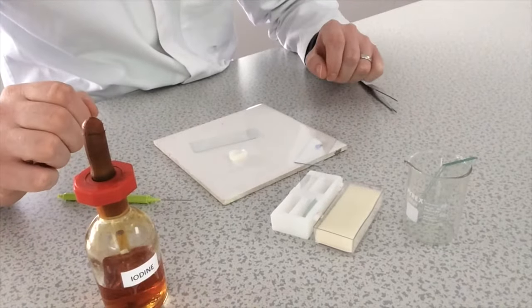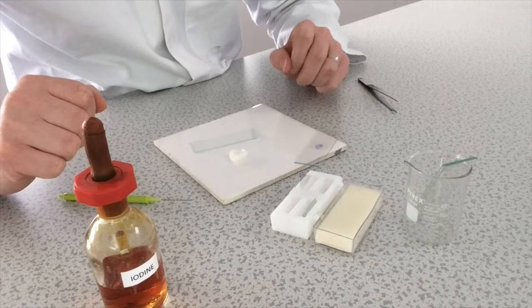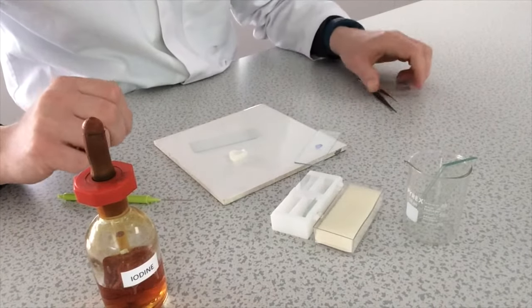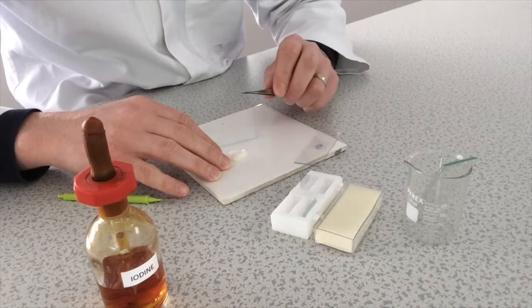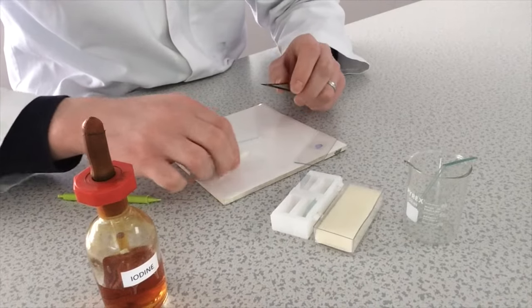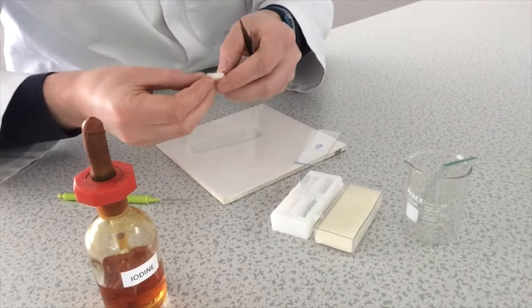So I'm now going to prepare my plant cell, onion cell slide. So I've got a freshly cut piece of onion and what I'm going to do then is using some forceps I'm going to peel a thin layer of the epidermis from the inside of this freshly cut onion.